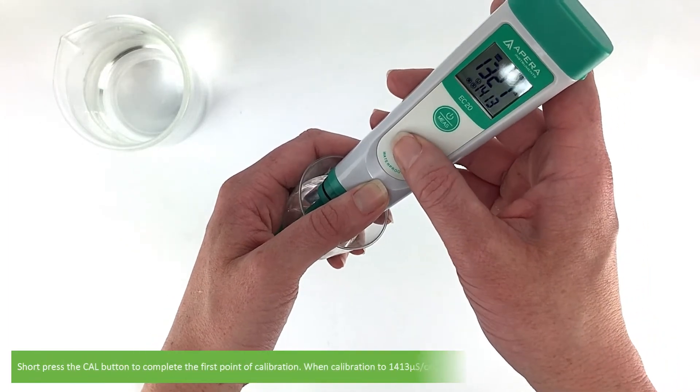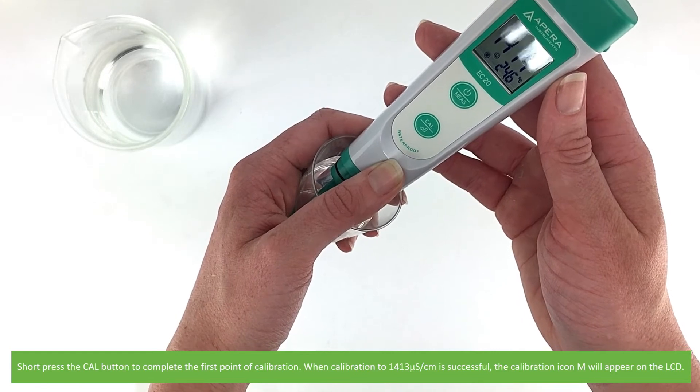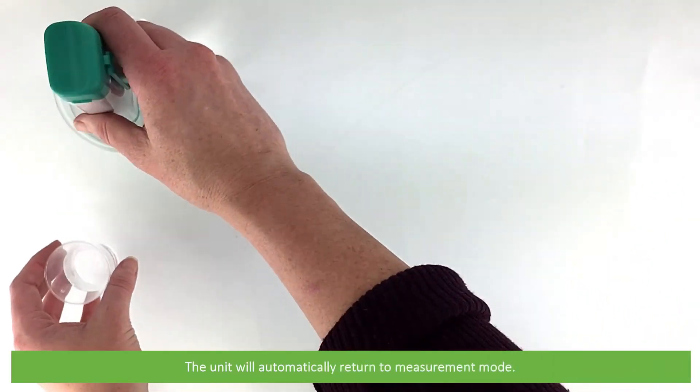Short press the CAL button to complete the first point of calibration. When calibration to 1413 microsiemens per centimetre is successful, the calibration icon M will appear on the LCD. The unit will automatically return to measurement mode.